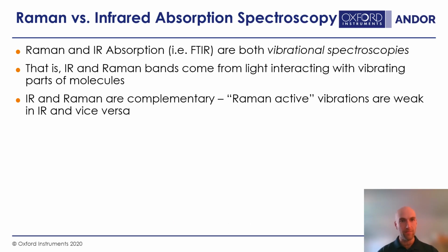Just a quick note about the difference between Raman and infrared absorption. Raman and IR, sometimes typified by FTIR, are both vibrational spectroscopies. That is, IR and Raman bands come from light interacting with vibrating parts of molecules, or vibrations in molecules. So IR and Raman are complementary.